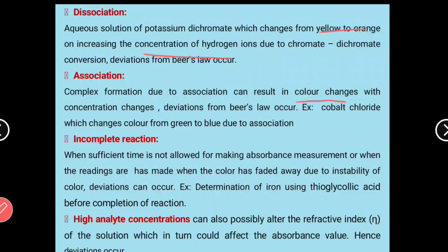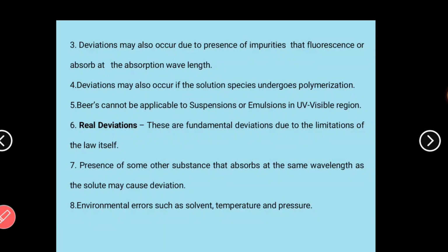Next one is high analyte concentrations. These can also alter the refractive index of the solution, which in turn could affect the absorbance value, hence deviations occur. Apart from instrumental deviations and physicochemical deviations, there are other deviations that also occur in the sample solution.